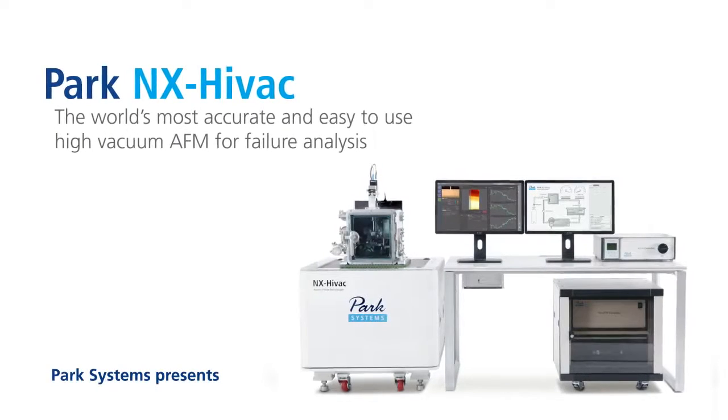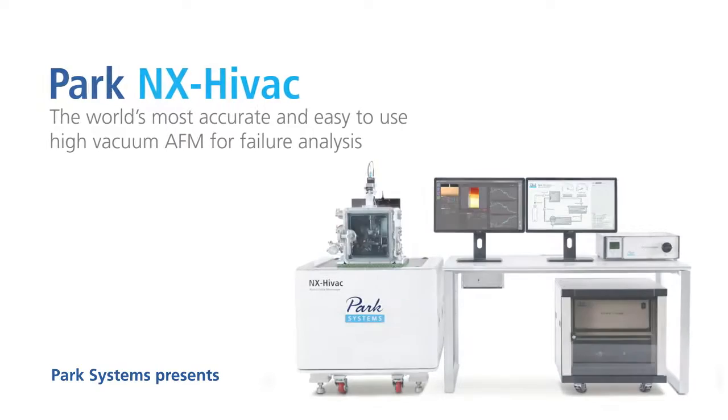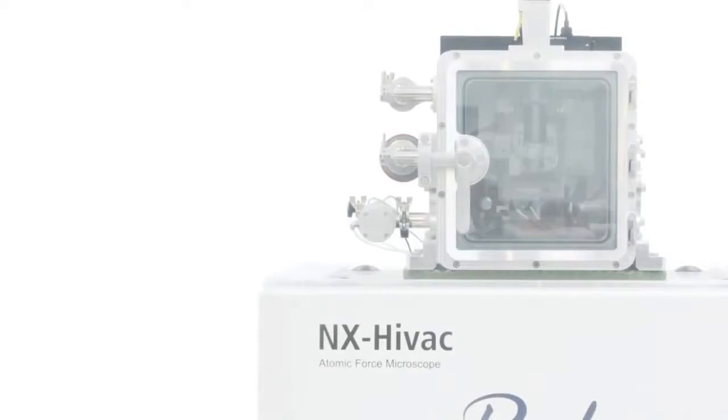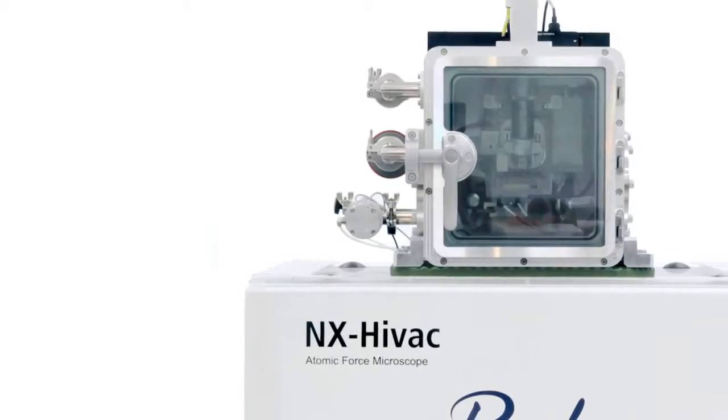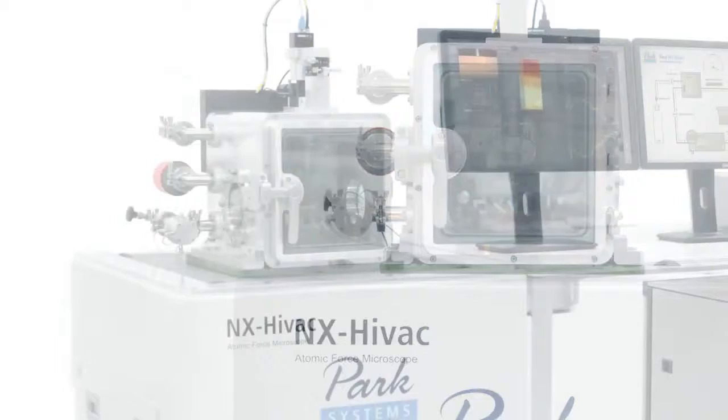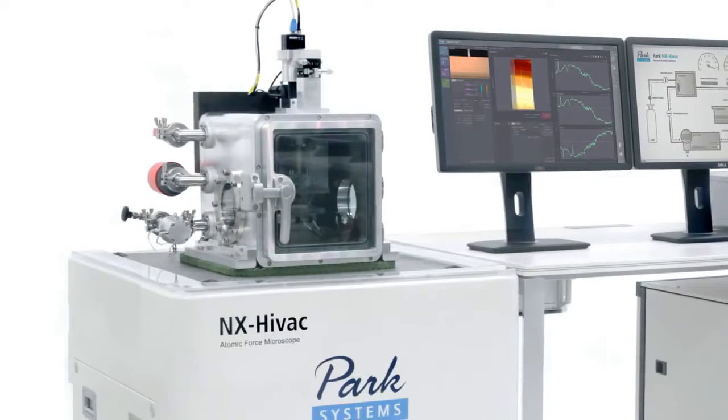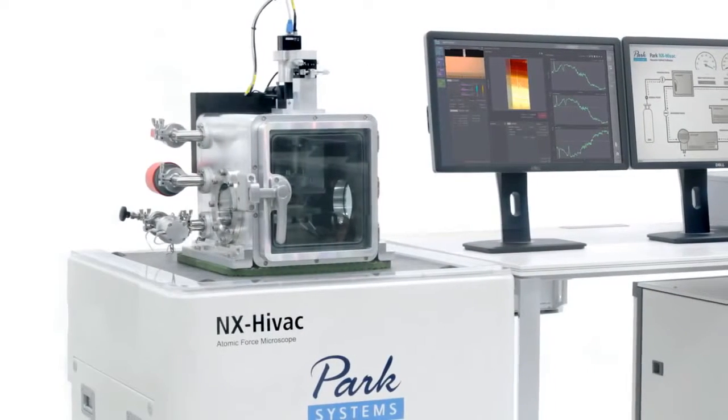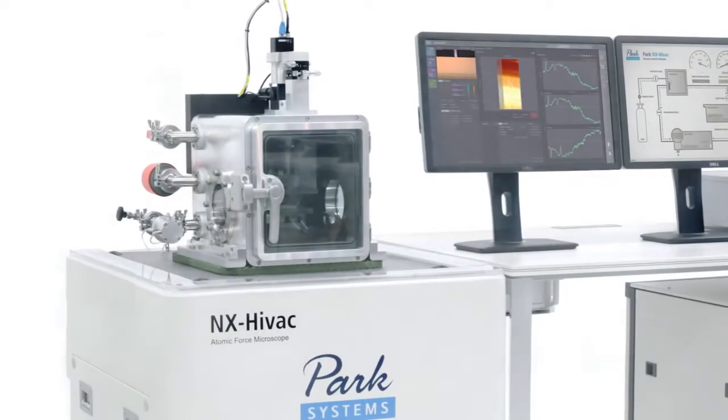Introducing Park NX-Hivac, the newest release from Park Systems. The Park NX-Hivac was developed specifically for semiconductor failure analysis, an application requiring high vacuum AFM.